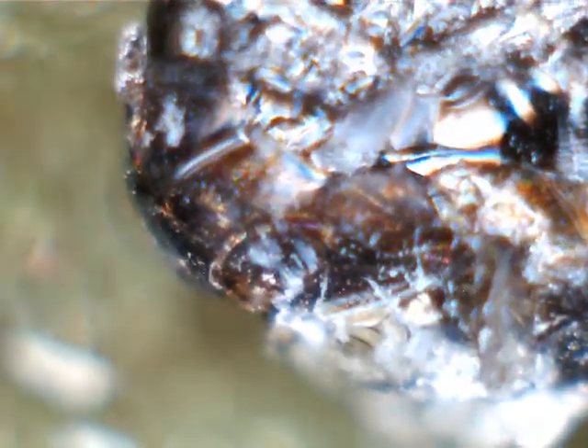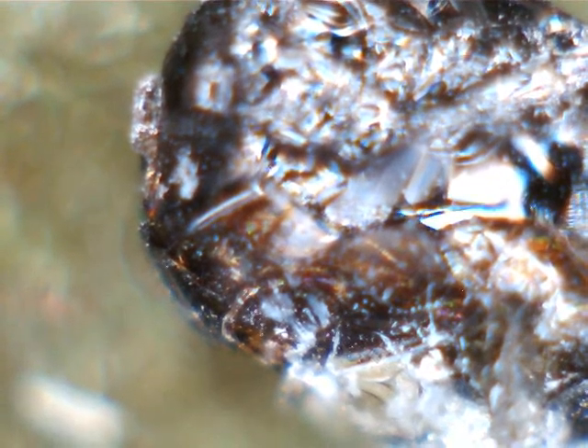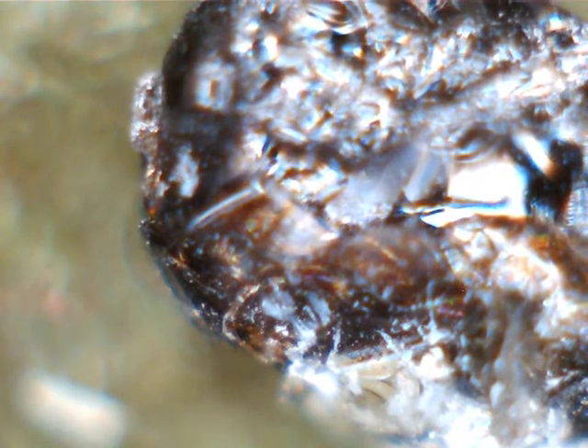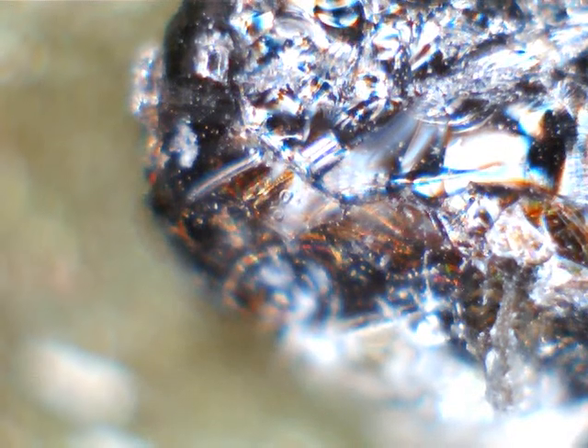This is a pretty concentrated piece, but you can see the gold in there. I think there's probably more where you see black, but it can be cleaned with ammonia. It may take several shots of ammonia before you can really start to see it.